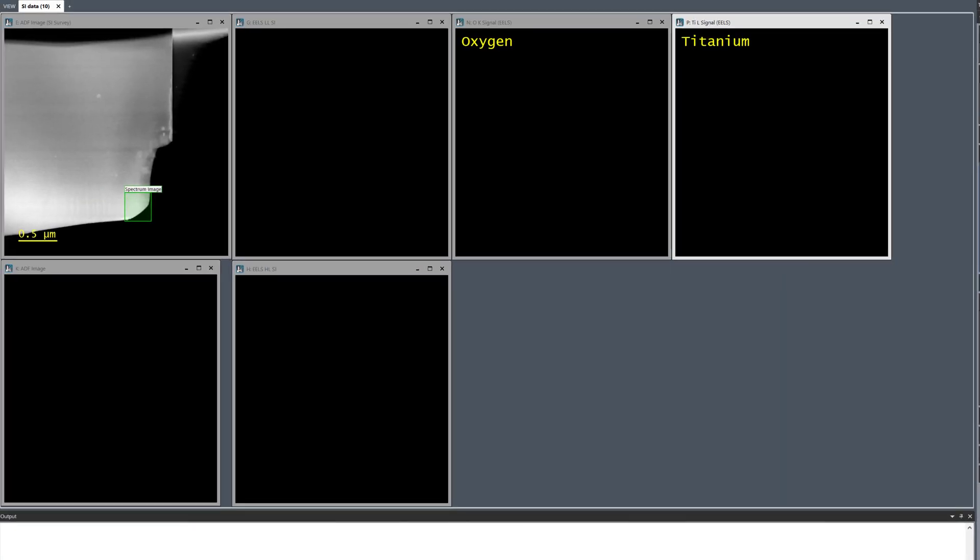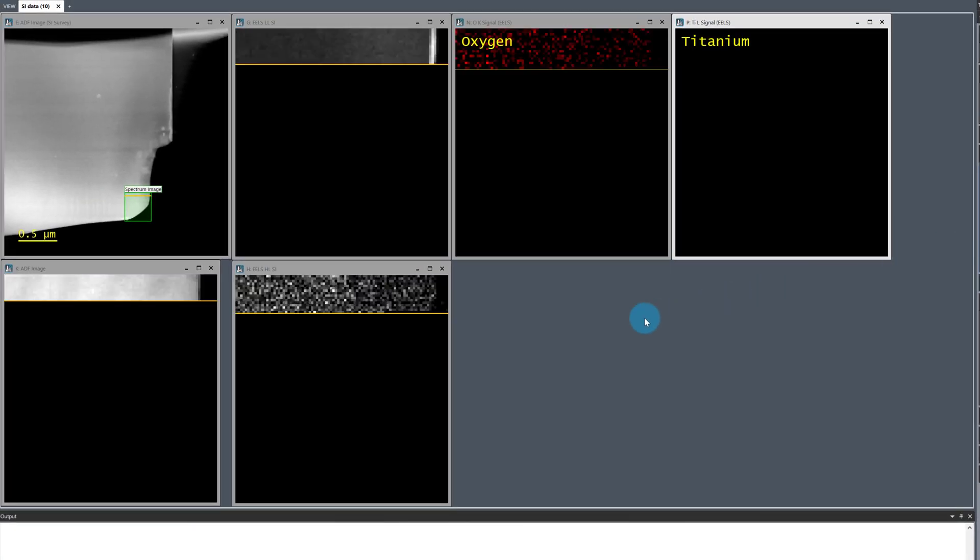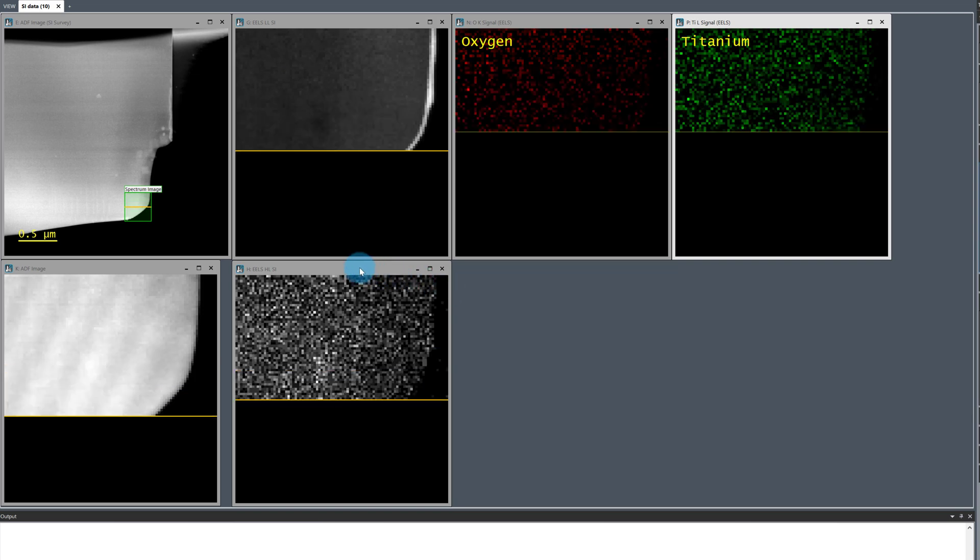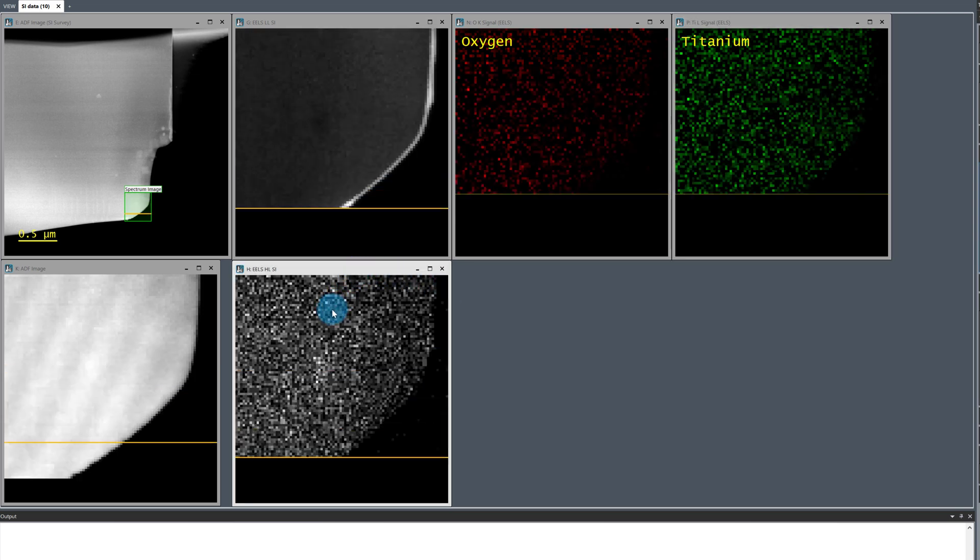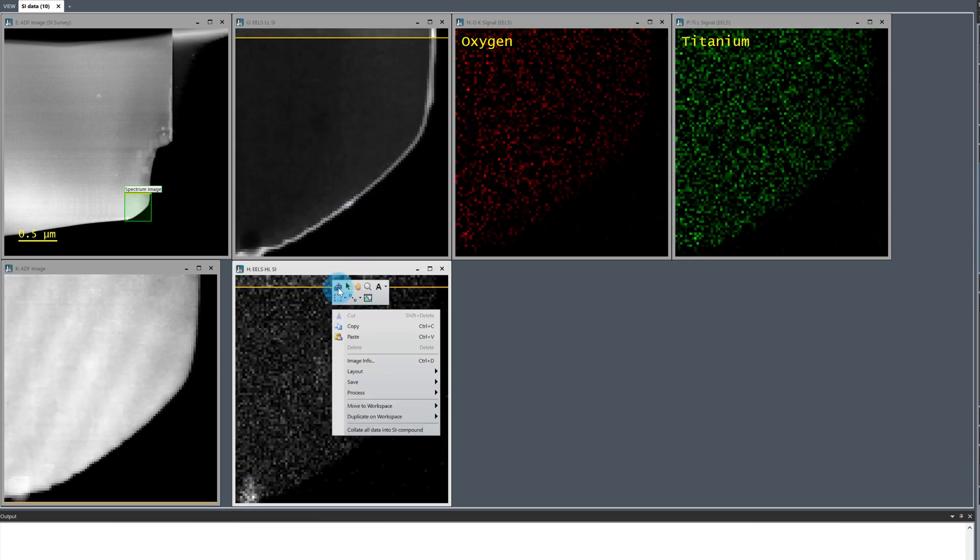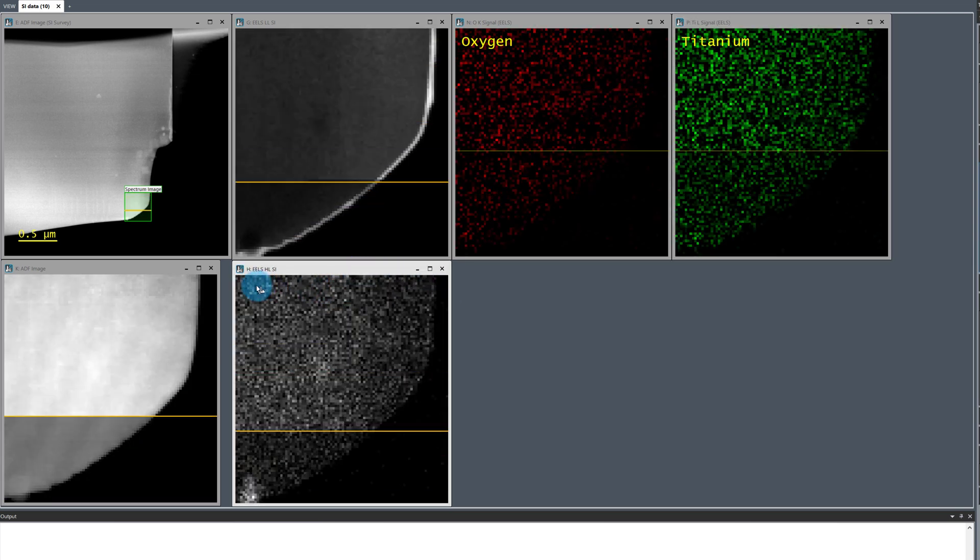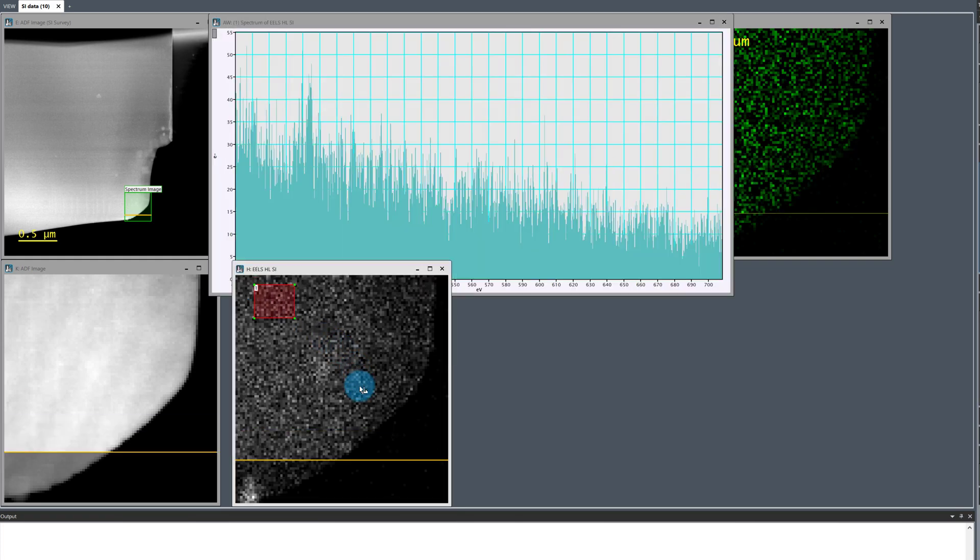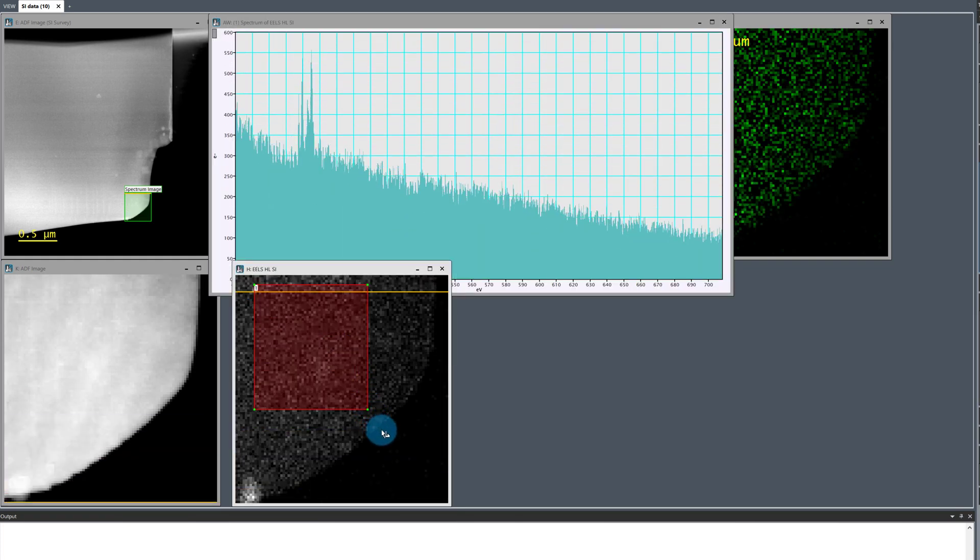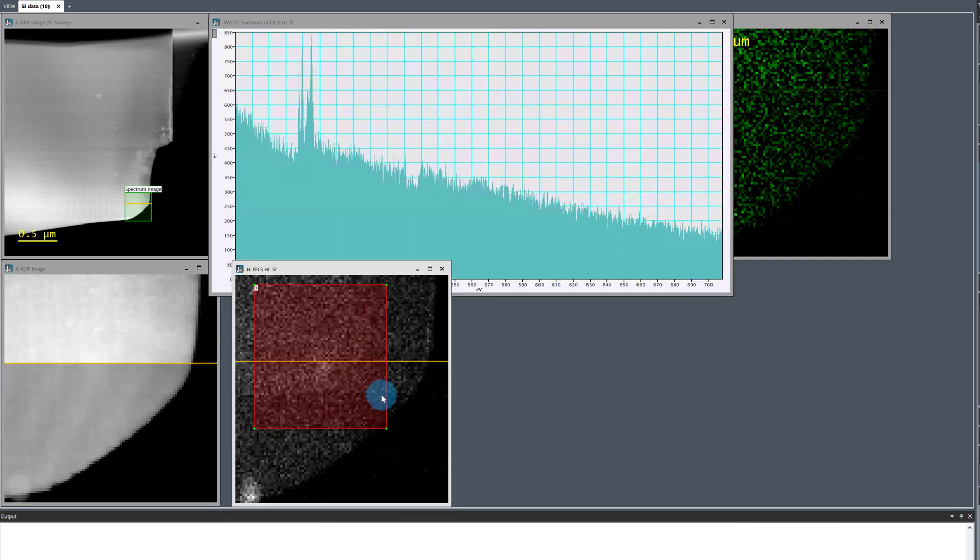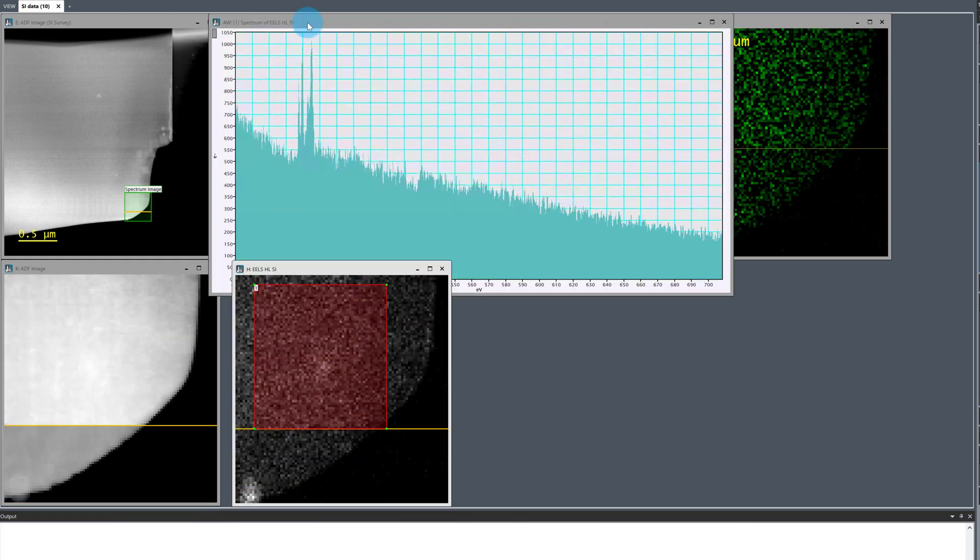As you can see, the steps to acquire spectrum image data in digital micrograph using the Stellar camera are much the same as any of our other supported EELS cameras and all of the processing and analysis tools that we are familiar with behave as you'd expect.